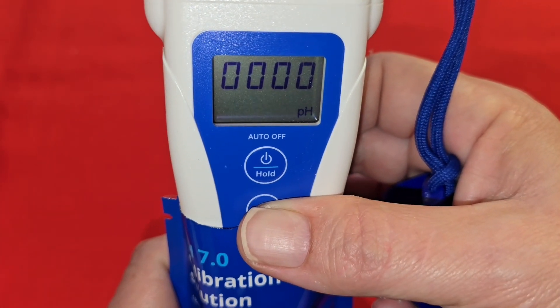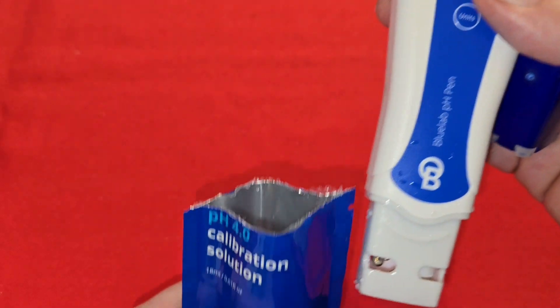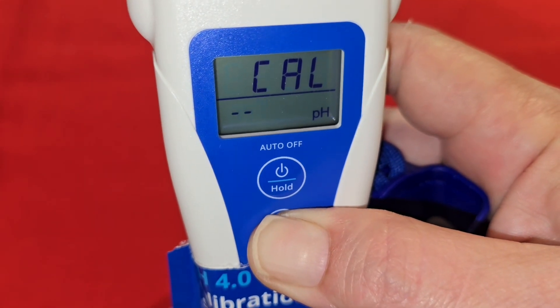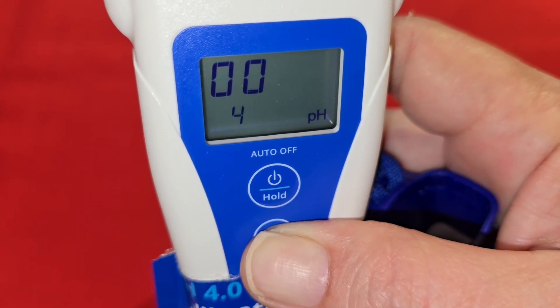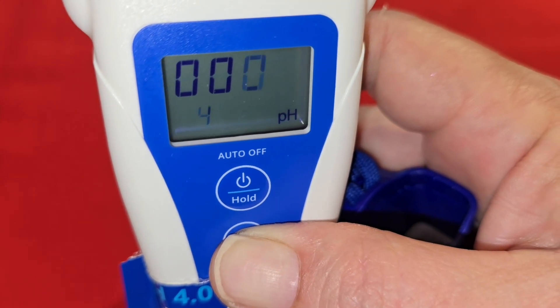Rinse off your probe and we will get ready to calibrate to 4. After you've rinsed your probe, open the satchel and place the probe inside the satchel and hit CAL. Now we're going to see the calibration to 4. Four zeros means it's been properly calibrated and it's ready to use.